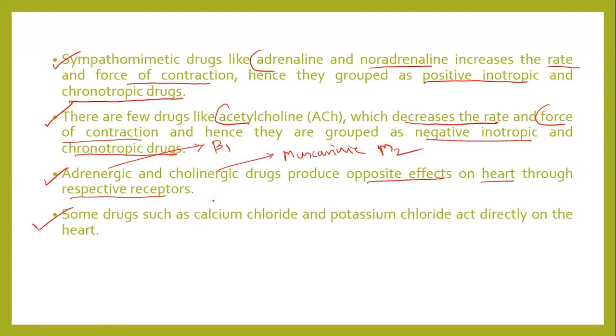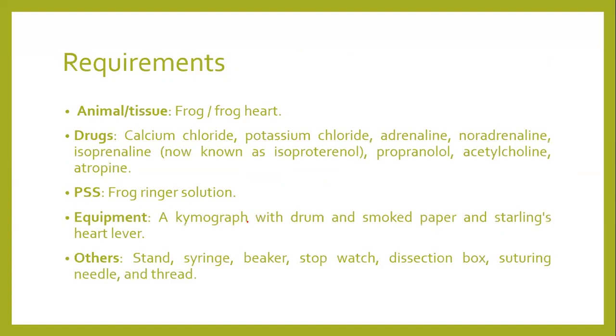Some drugs such as calcium chloride and potassium chloride act directly on the heart. What effects these drugs will produce, we will see in later parts of this slideshow. One second. So these are the requirements.